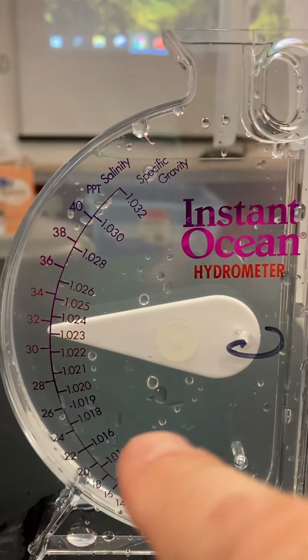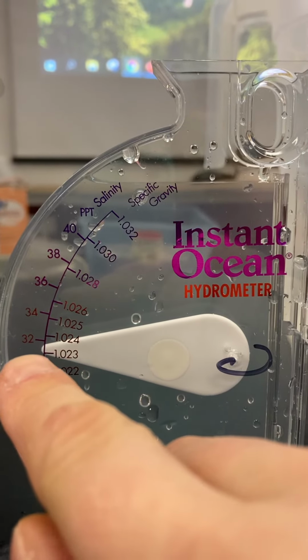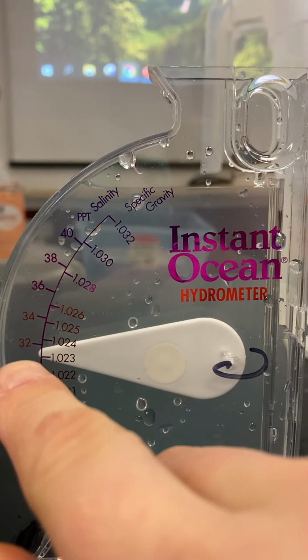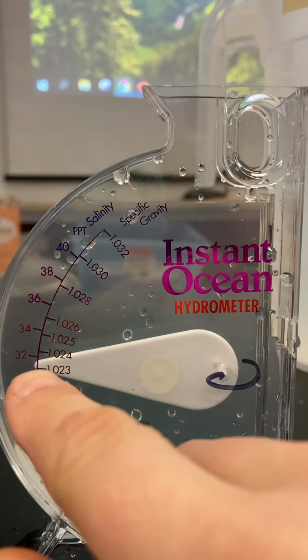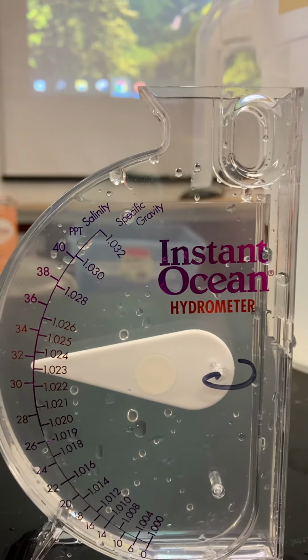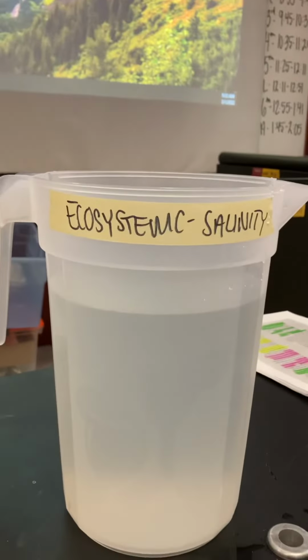So if we look at our salinity, looks like here's 30, here's 32. So at about 31 and a half almost. So 31 and a half parts per thousand. Remember, parts per thousand is PPT. So record about 31 and a half PPT for your data table for Ecosystem C. That's all we have for Ecosystem C.